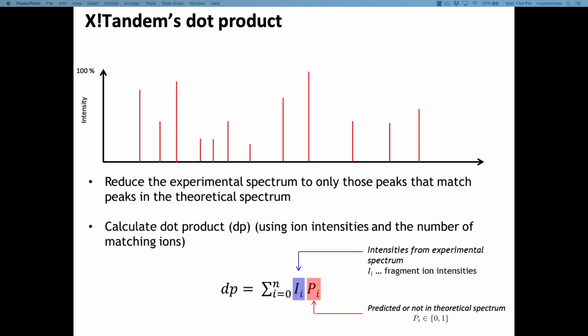We also discussed post-translational modifications. If there are post-translational modifications to this peptide and you did not tell the search engine to look for this particular post-translational modification, it will miss it. Or if you have genomic variants that translate to different peptide sequence, then this sequence cannot be in your reference proteome. So there are many reasons why this may fail. And that's something we will discuss later this afternoon, how we deal with this type of error.